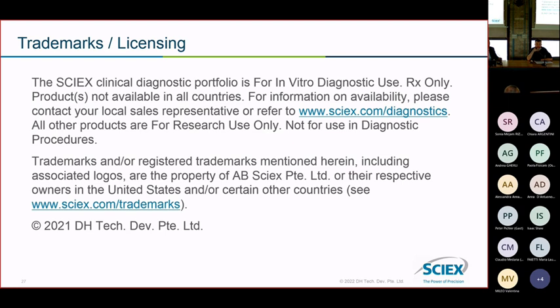A second question. A long time ago, a scientist called Markus Ralser, probably you know him, published a paper about scanning SWATH on the instrument that... 7600 or something? No, 7500. He published this on the TripleTOF. It was the TripleTOF 6600. So this is the 76, and the other one is the 66. The TripleTOF product line is the 66, which Markus published.